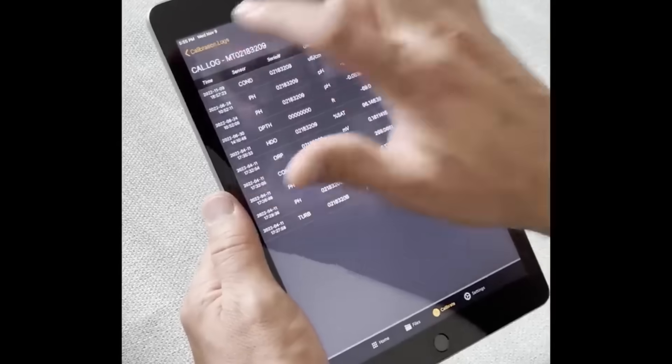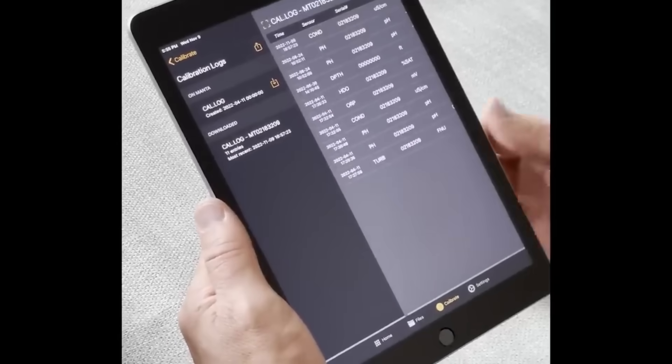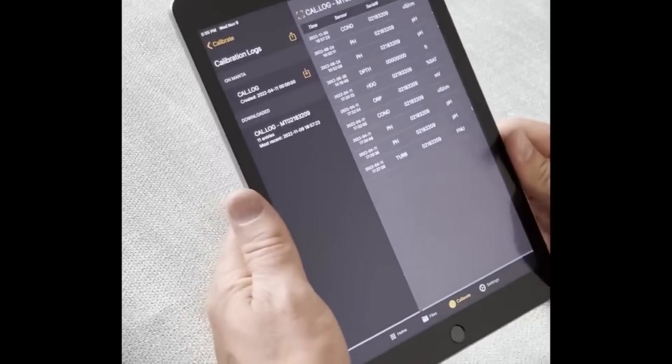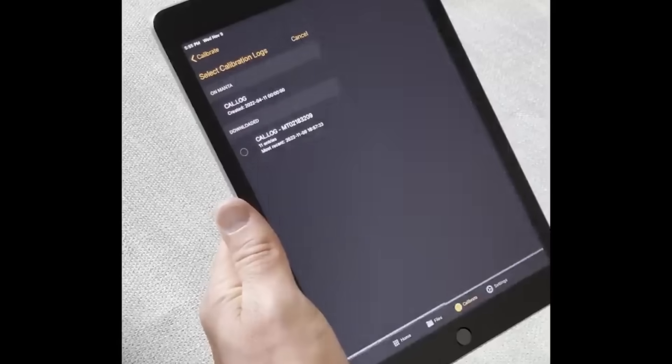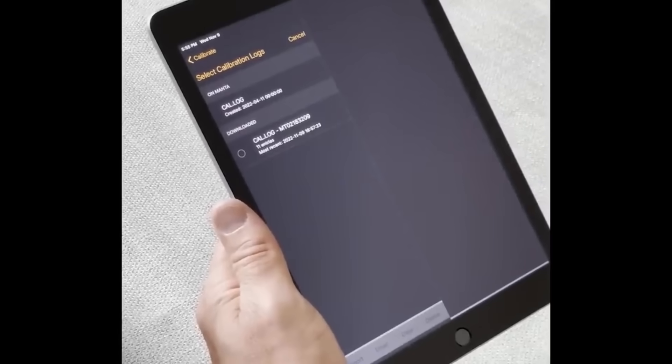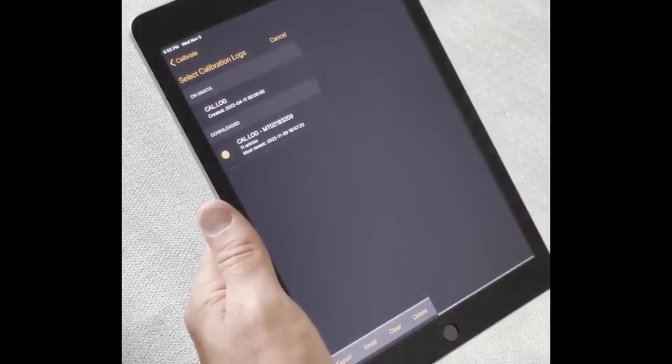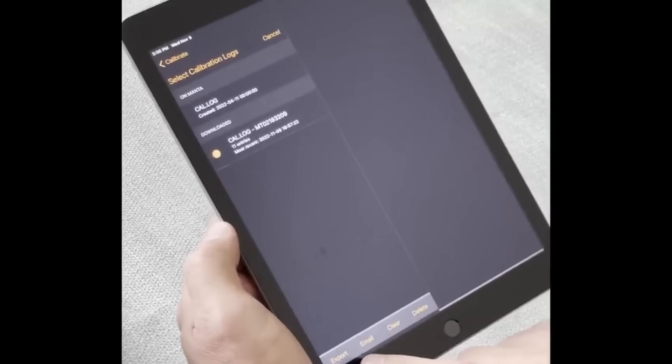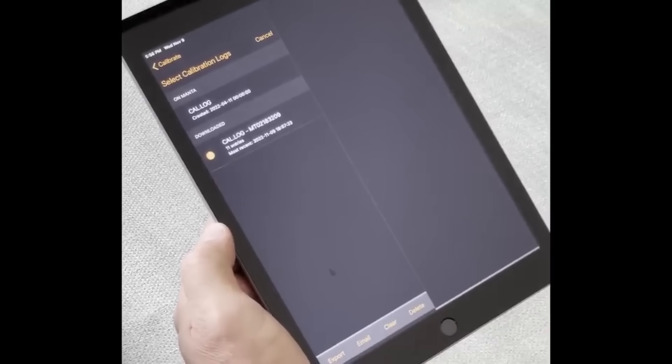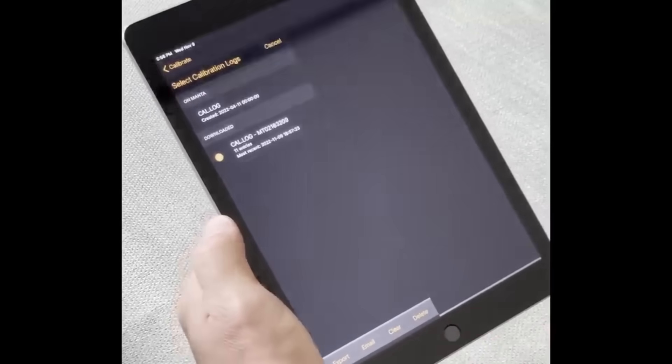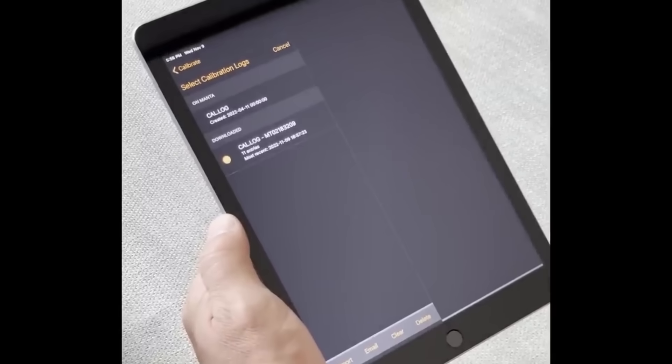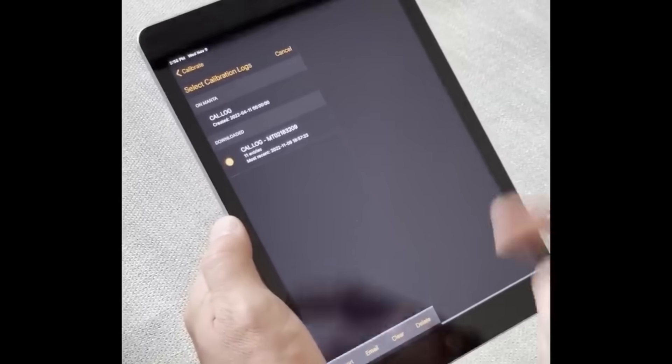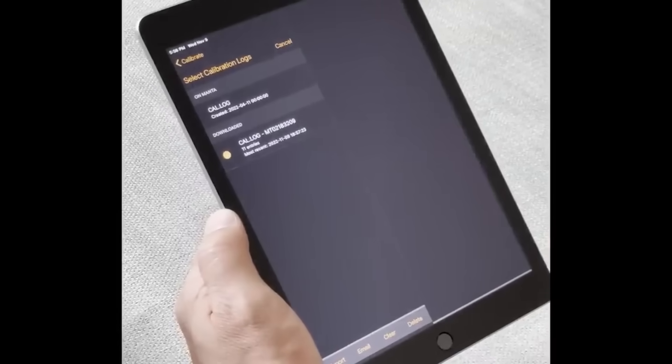To go back, you tap the top left arrow back. You can also tap the export icon and select the downloaded cal log that you want to either export, email, clear, or delete, very much like your snapshot files and log files. So you have all of the same functionality there.